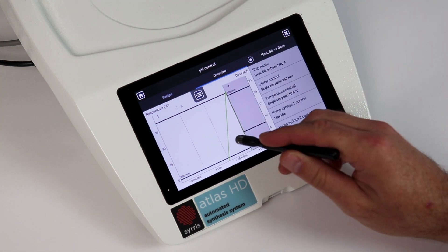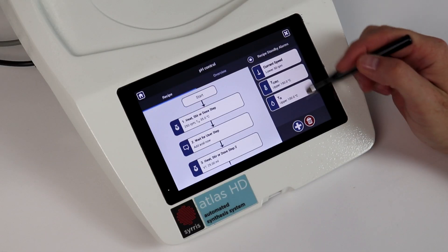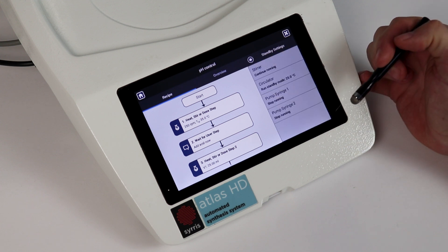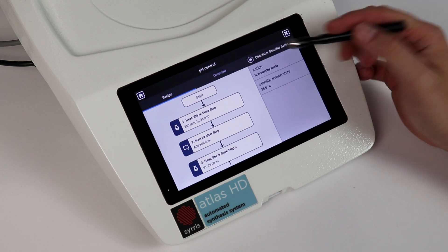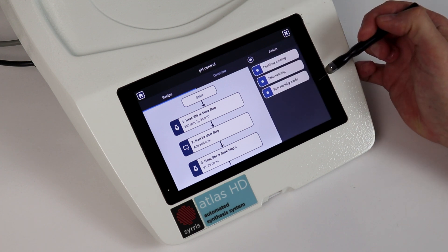View your entire experimental procedure at a glance with the recipe overview. Integrated alarms and standby conditions ensure full walkaway operation, allowing you to set all hardware targets to safe values in the event of an alarm, giving you the confidence to perform out-of-hours experiments, increasing efficiency.